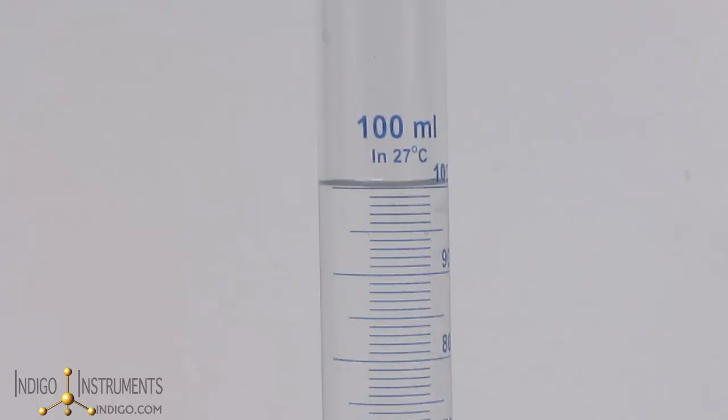Where you fill a graduated cylinder will determine how accurate the measurement is. The specification of 1% is met at the full level of filling, in this case 100 milliliters.